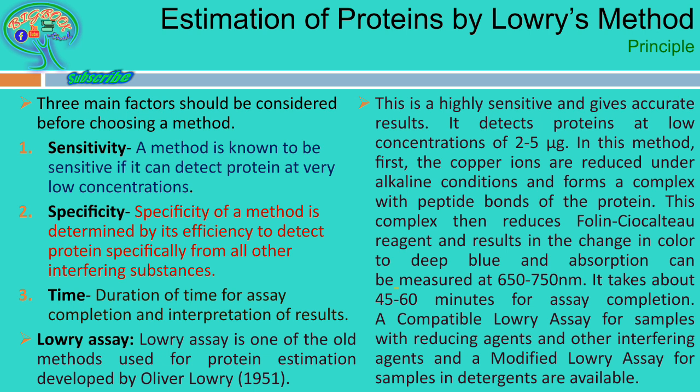Time duration for assay completion and interpretation of the results should be very minimal so that the result can be achieved easily and early. Lowry's assay method fits under these three main factors: sensitivity, specificity and time duration.